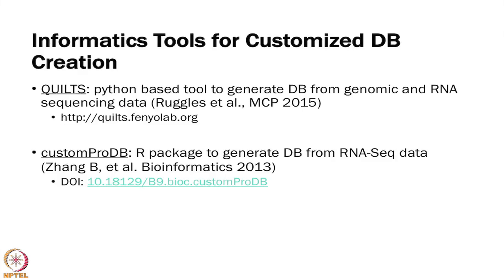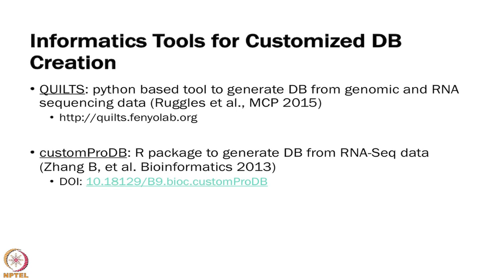So there are a couple of different tools for this. I mentioned two because these are the two that were created by two people who are in this room. His group was responsible for customProDB, and then David and I worked on Quilts. And so you can use both of these. I've linked to them. You're able to put in either VCF files and/or BED files and get back a database that has all of your information in it.